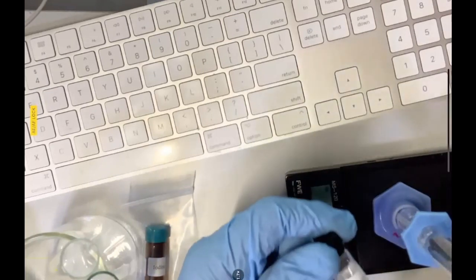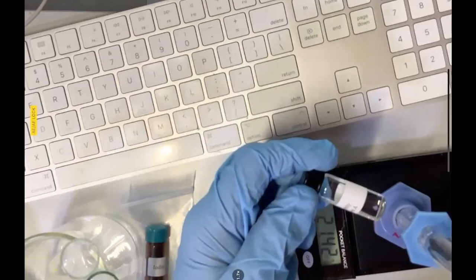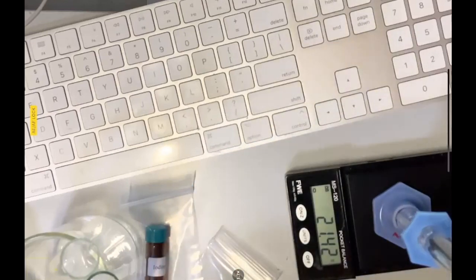Then I'm going to take liquid A. That's this one right here. I'm just going to pour some of it. Be careful so that the liquid doesn't spill over or spill on the scale. I'm just going to pour this into the graduated cylinder. It doesn't matter how much I pour in because I'm going to read the volume.